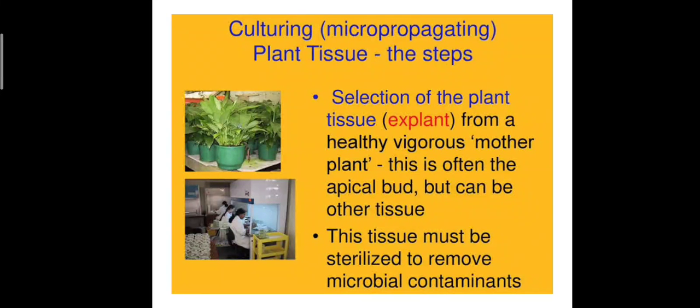Then the second step involves explant sterilization. The explants must be sterilized to remove the microbial contaminants, if any, present in that explant.